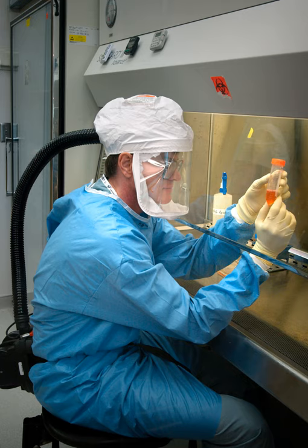As these filters load, the internal fan is required to do more work to pull the same volume of air through them. Newer cabinets measure the air flow constantly and self-compensate fan performance to ensure constant volumes of air moving through the filters and the cabinet. If the flow drops below desired performance, an audio and visual alarm will alert the operator.